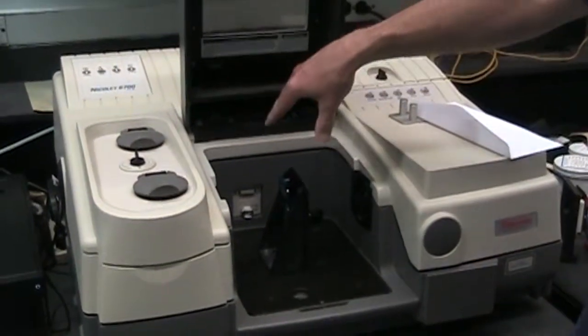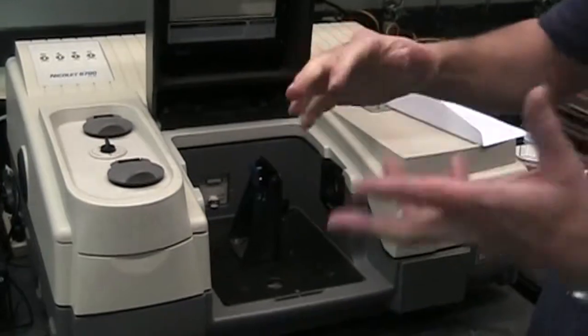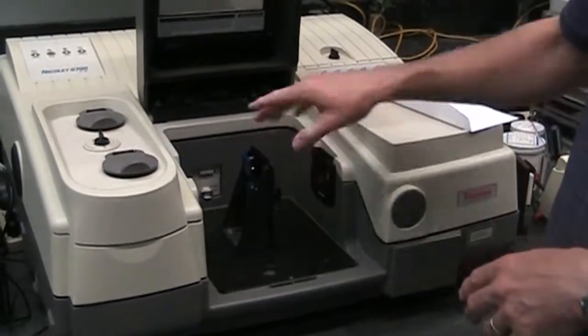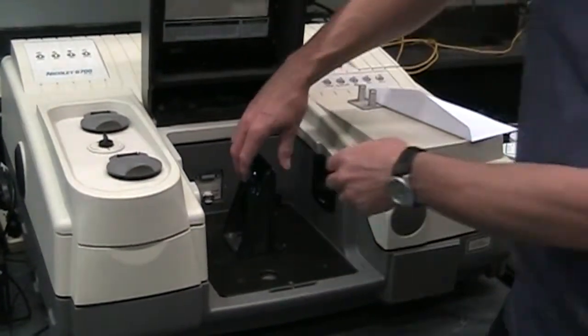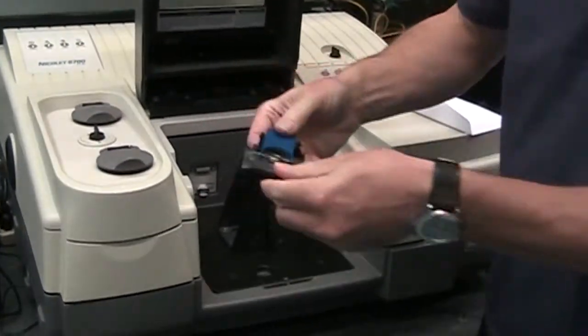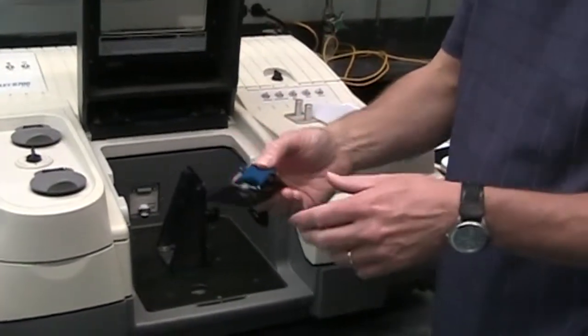Okay. Before you put your sample in place, again, you would set up your instrument, set up your method, number of scans, resolution as directed, run a background, and then run the sample. And it would present it, and then you can manipulate that to sample. So that's a film sample. And this is a pretty versatile holder. So you could also use it for salt plates.